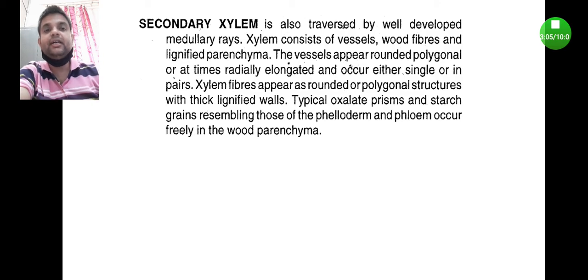So xylems are lignified. Calcium oxalate crystals and starch grains are also found in the xylem.